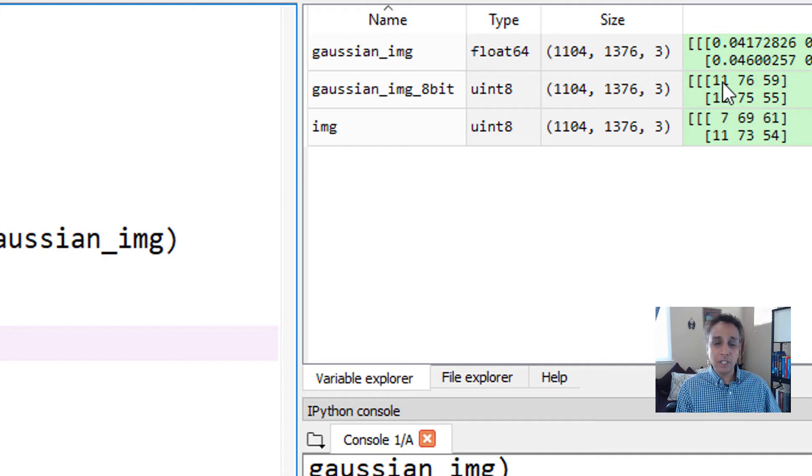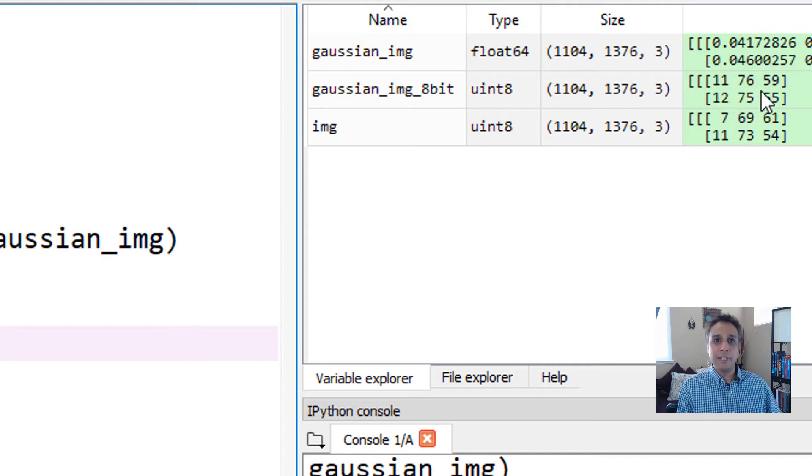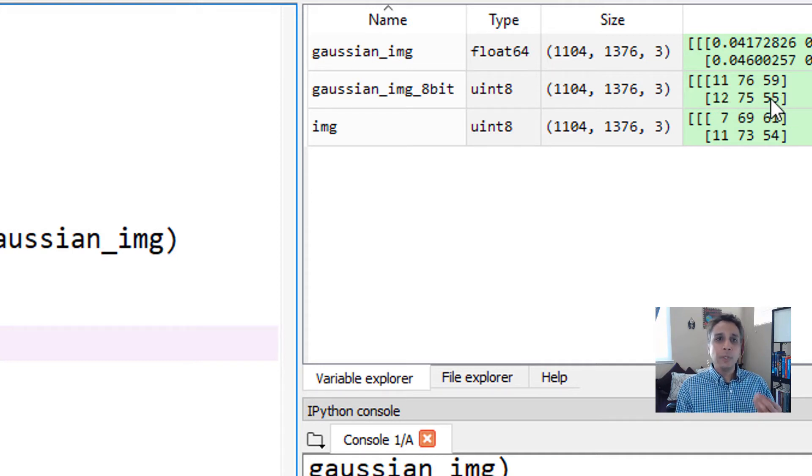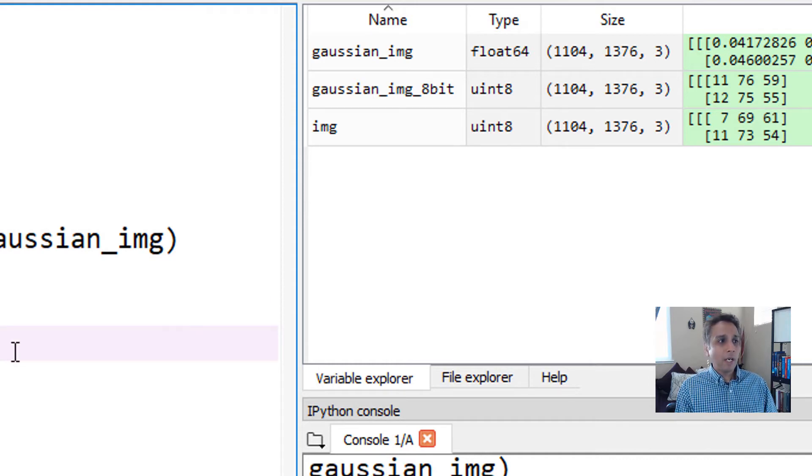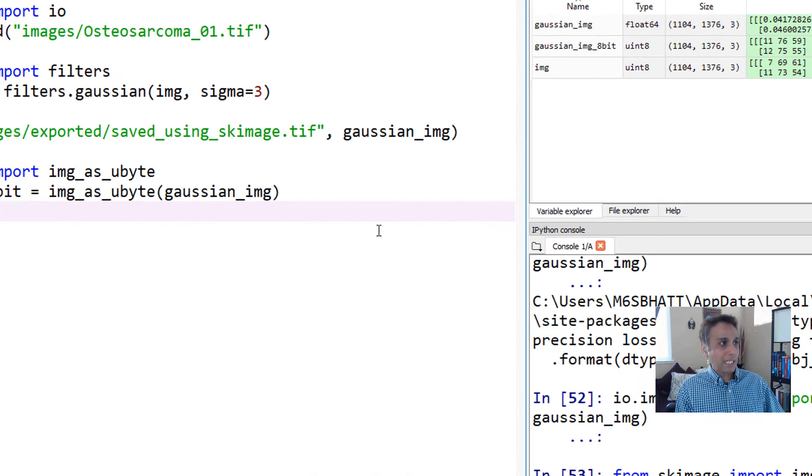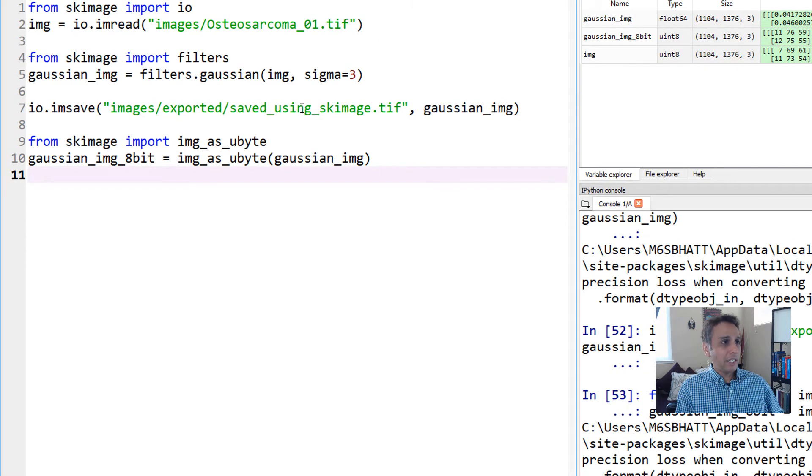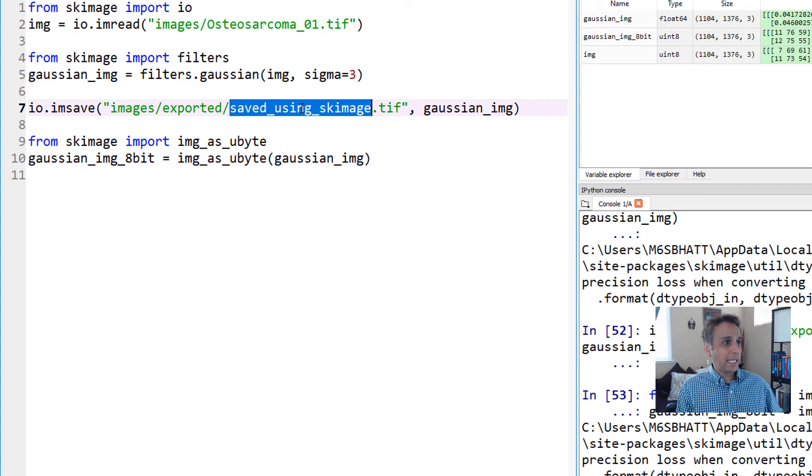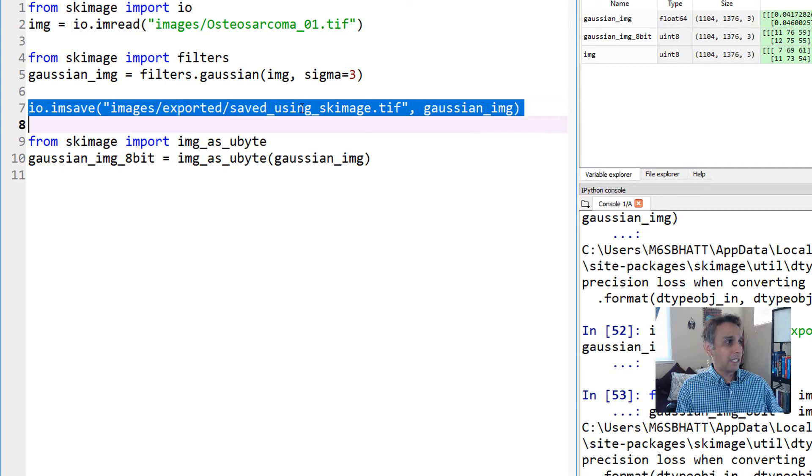Let's run these lines and look at the output. Now I have gaussian_img_8bit which is unsigned integer 8. If you look at the values, they have meaning now - they're 11, 76, 59 and so on, which means these are real pixel values.